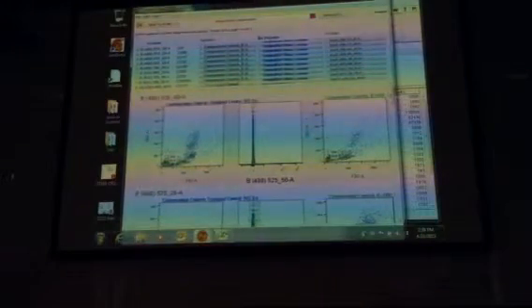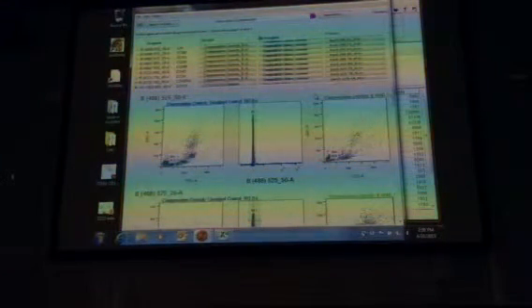With the compensation, this is different because it's the newer version, and I'm not totally familiar with it. But within your samples, you have all the data, all the samples, and then those samples which have been designated the compensation controls, for all the different parameters which have been collected, as well as the unstained control. If you go into your compensation matrix like this, it will calculate it like you've done for your other assignments, yeah?